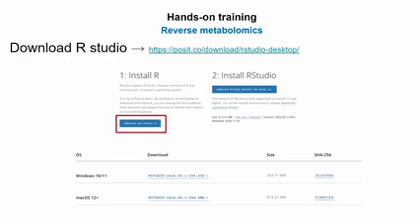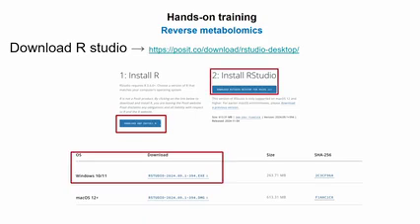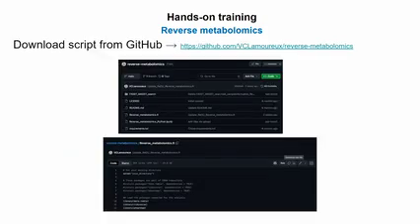Let's wait. And then for the code, the script part, we were just going to go a little bit faster, because you need to download R for those of you that don't have it, and then download RStudio, so it would take some time. So we're just going to go through, so you can just follow along, right? And then repeat the same thing yourself when you get good internet access. And we're going to be here throughout the whole conference, so you can grab one of us and we can go through it with you. And maybe very quickly, who has R on their computer? Okay. Oh, good. For those who don't, maybe move next to somebody who does have it, because I think downloading R will not work with the internet here.